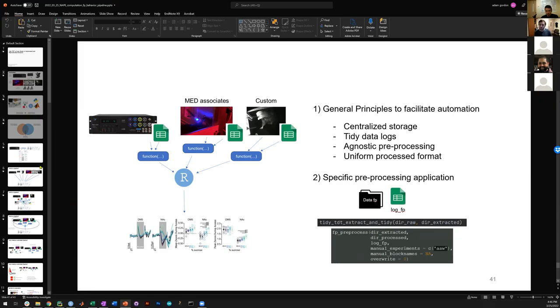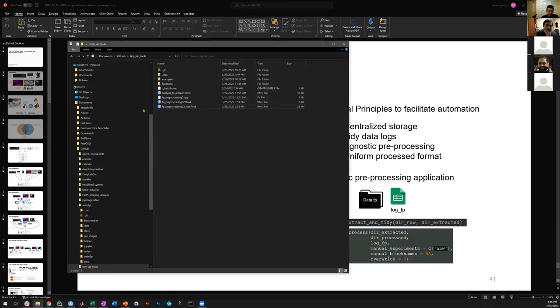But everything I've done with TDT has been downsampled. So I haven't run into any issues, even though I'm combining across like 50, 60 files. I don't run into issues with memory. I see. So you downsampled to 20 times less data. So typically for an hour's worth of data, how many data points do you think you get? I can check. I can show you the size of it anyway.